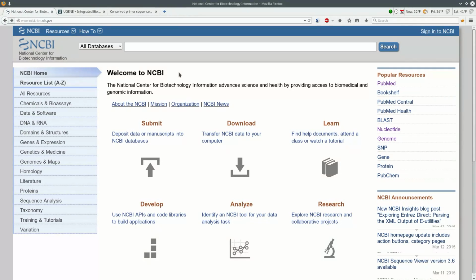In order to do that, I have to sequence a portion of their genomes, namely the ribosomal region, and compare that sequence to known sequences that are in the public databases. So, I'm going to show you how you can browse genome data and design primers for PCR and sequencing.